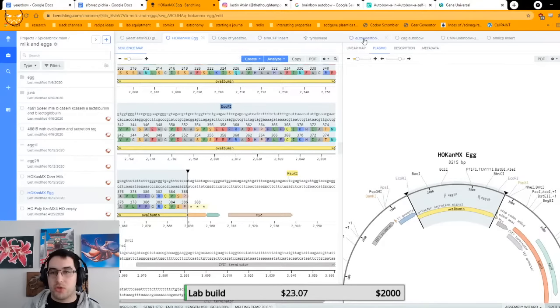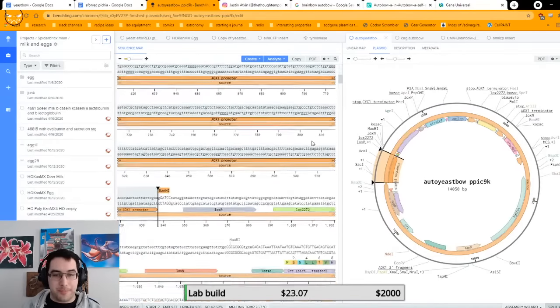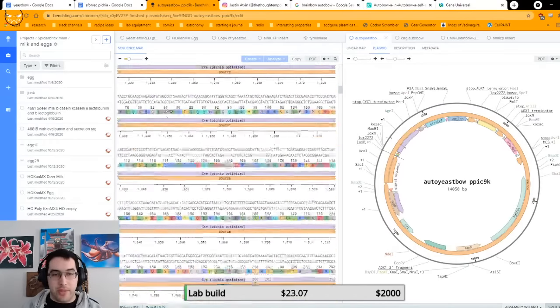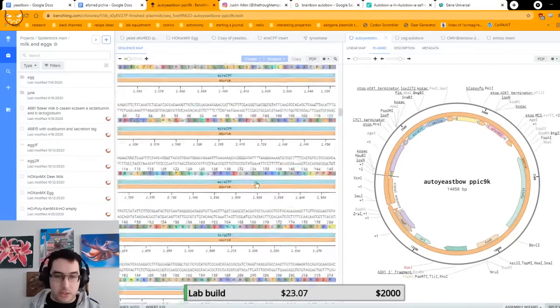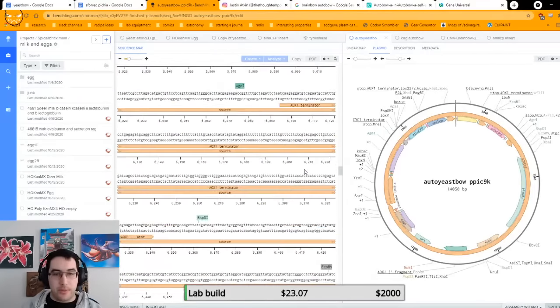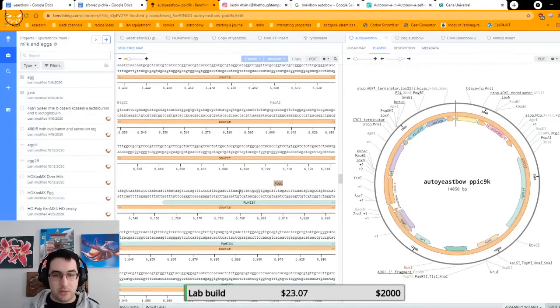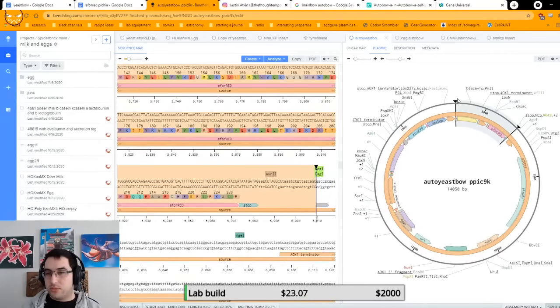Anyways, so let's go to Auto Yeastbo. Okay, so I want them to make this chunk, right? So basically from this promoter, I want them to make from about there. Oh, I clicked on something by accident, my bad. So I essentially want them to make from that all the way to the end. So you scroll all the way to the bottom. That's the terminator. Okay, now that's part of the thing, basically here. So I basically want them to make this whole giant chunk here.